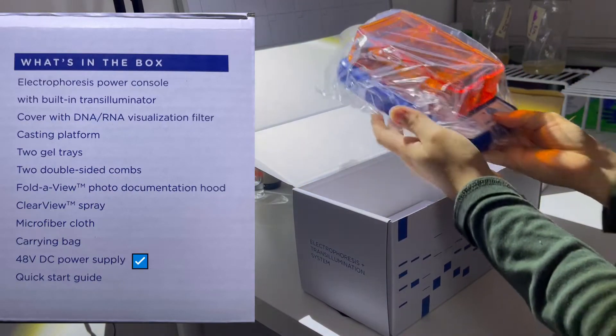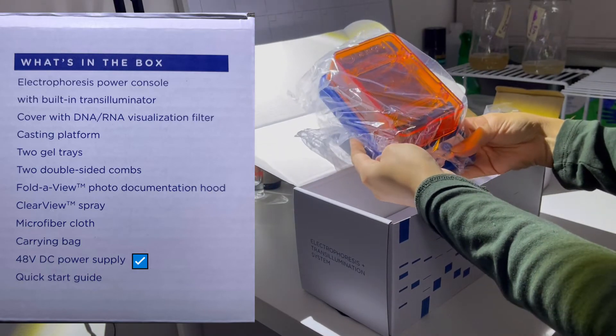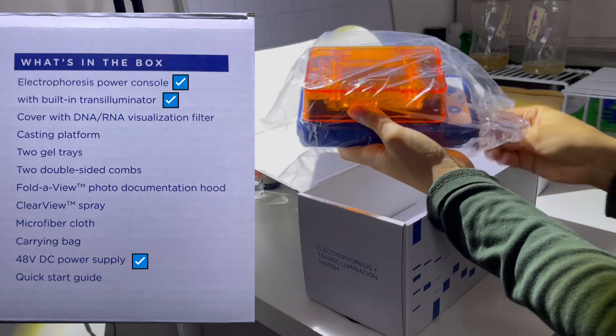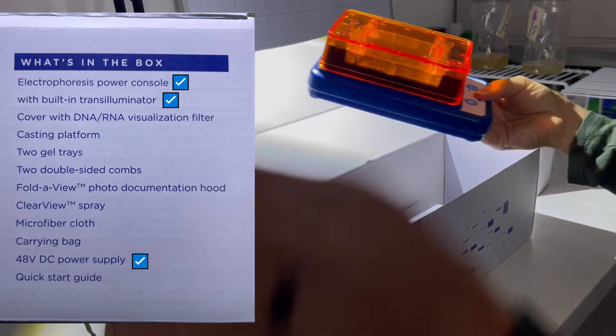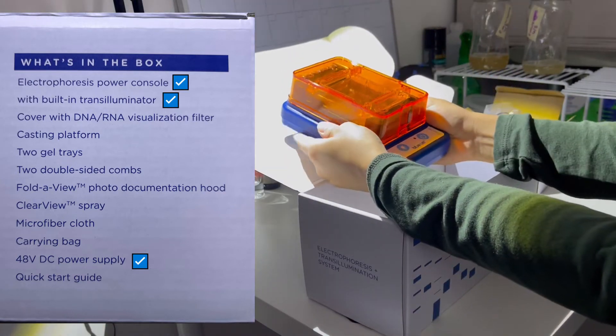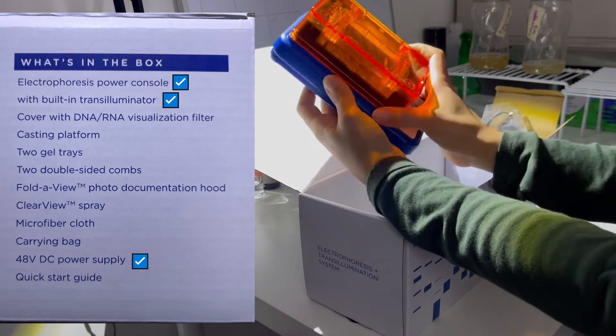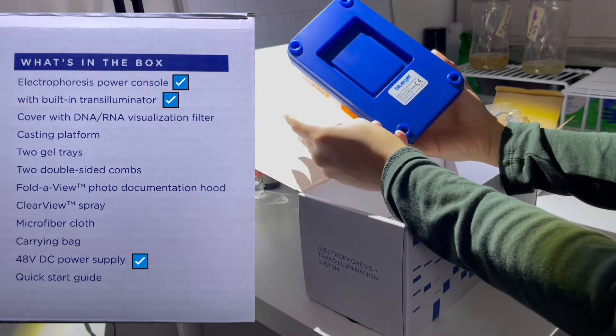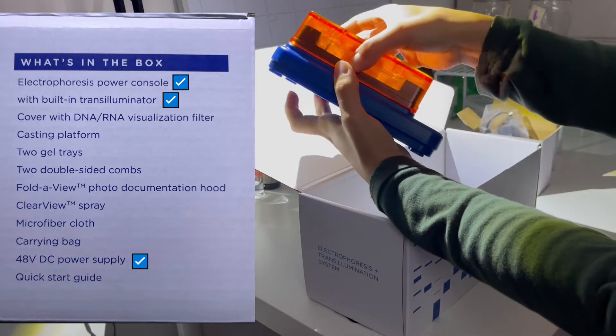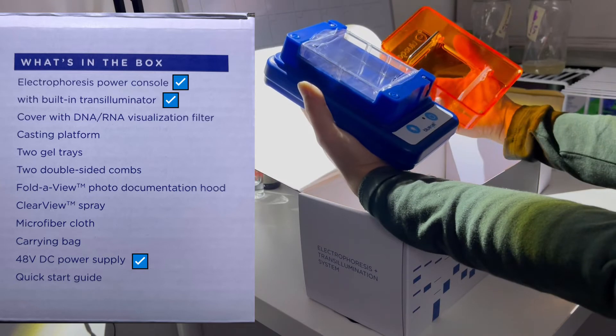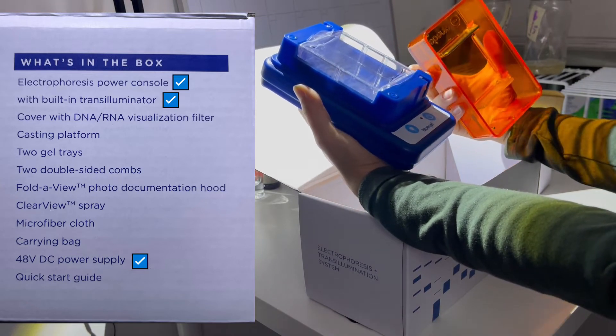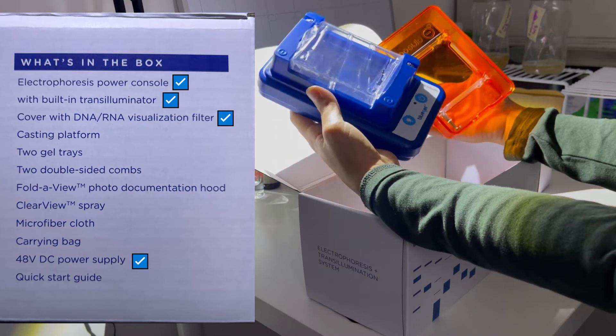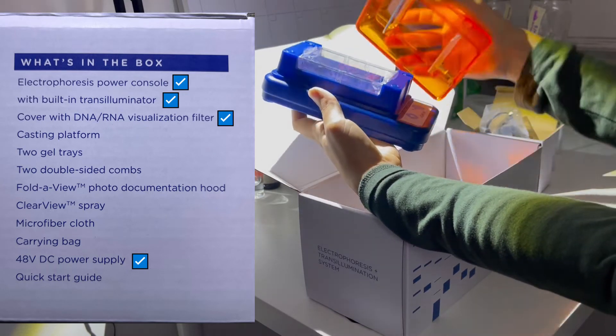And here's the machine itself. Nice. It's actually pretty light, lighter than I thought. It's really small, I like it. And I'm guessing this orange covering is what they call the visualization filter so you can view the DNA or RNA bands. Cool.